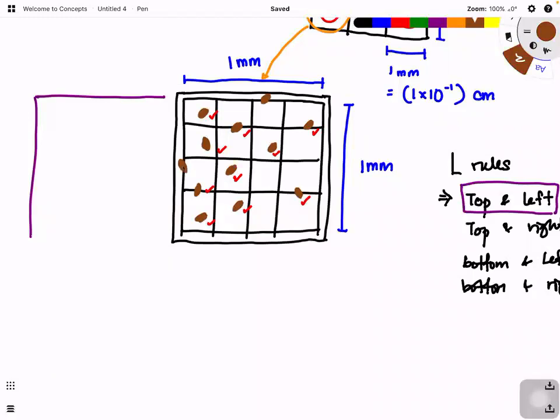Let's say, for example, I have a cell that touches the middle lines like this. So those I will count. But some of the cells that do not touch these two lines, those cells I won't count. So I only count the cells that touch those two lines. But I have to define it first. I cannot see it already.